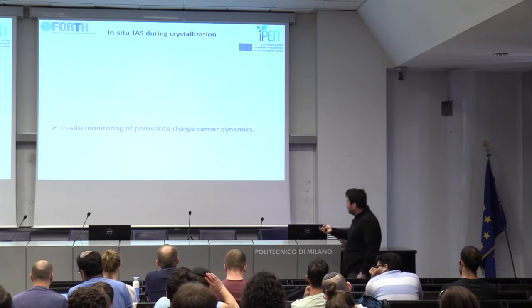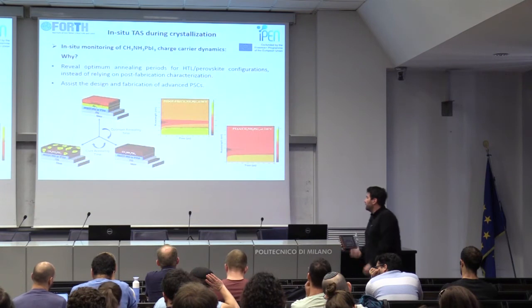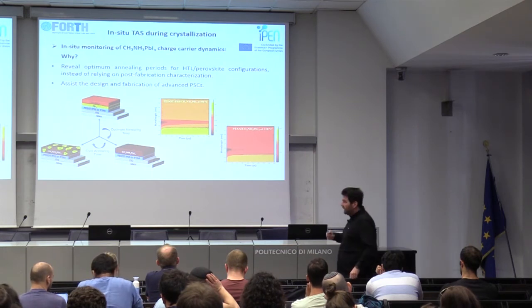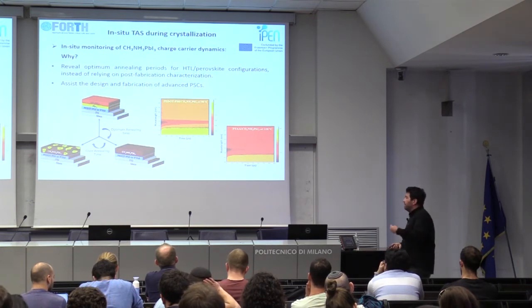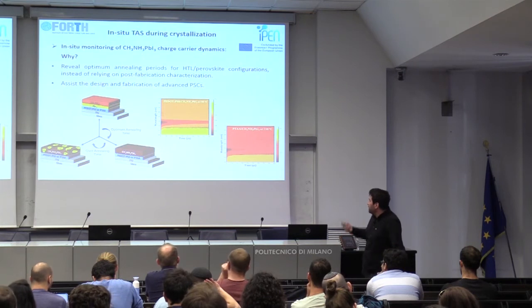So we do in situ monitoring of perovskite charge carrier dynamics. And we would like to do this because we believe that this will be an important diagnostic tool in order to diagnose how the perovskite film will be during the fabrication process.